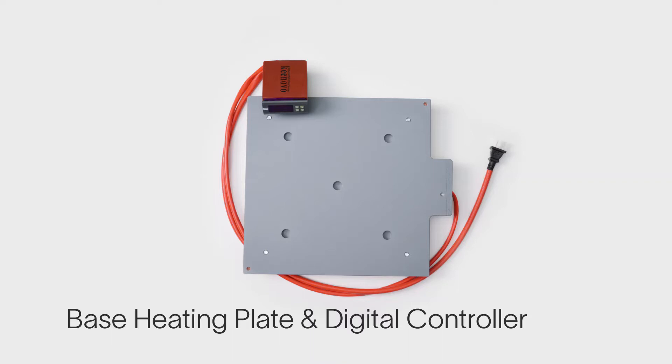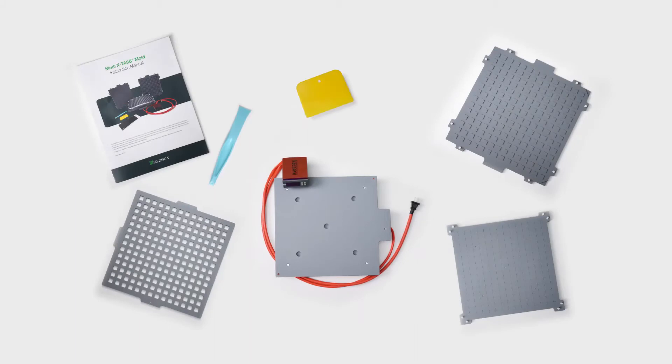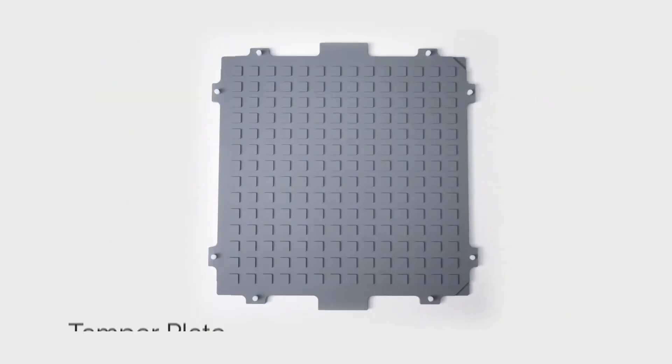The digital controller allows the user to easily adjust the temperature of the base heating plate. The Medi-X-Tab mold would not be suitable for rapid-dissolved tablets, or RDTs, without a tamper. This tamper allows you to not only press the tablets into shape, but is also used to help contain the heat while baking.